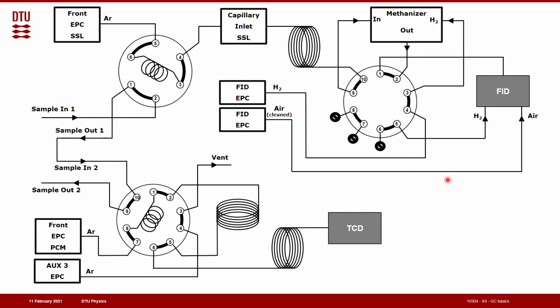So, after a minute or so, we close the first valve. Then it took some more minutes, around 3.7 I think, or around 4 minutes. Then we closed the back flush, the TCD channel, and then run the methanizer a little bit later.